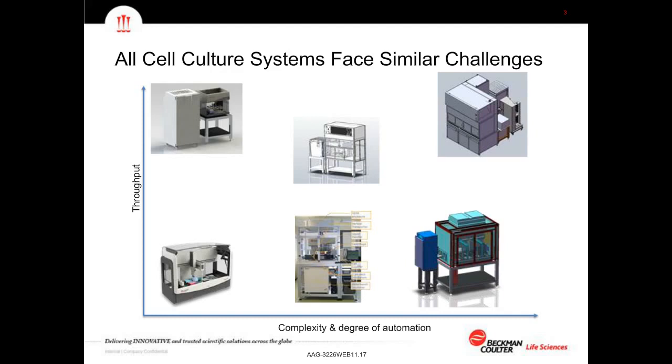On the bottom right, we have a more complex liquid handler, which you can't see on this image, but has some capabilities integrated on deck, attached to a relatively small incubator. Now what that system is doing in this particular example is 3D cell culture, which has a much more complex workflow, and we're only ever running a throughput of plates in the order of 10 to 20.